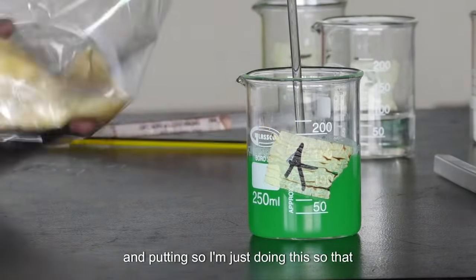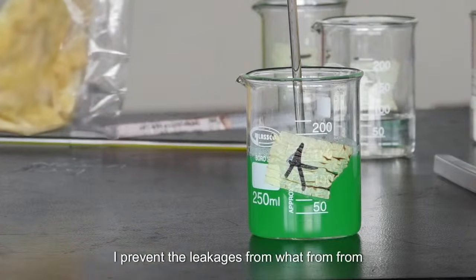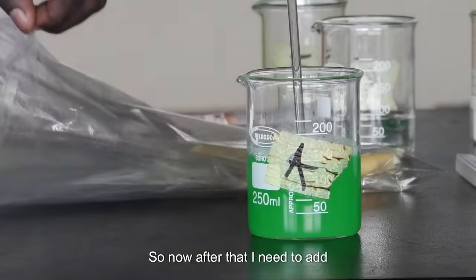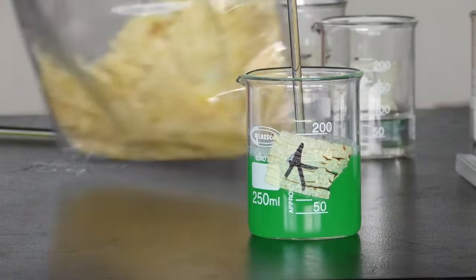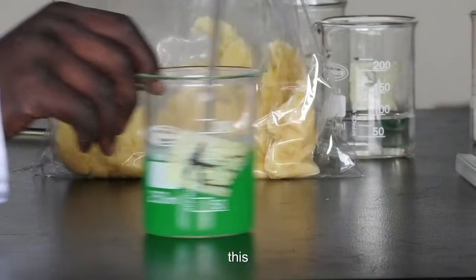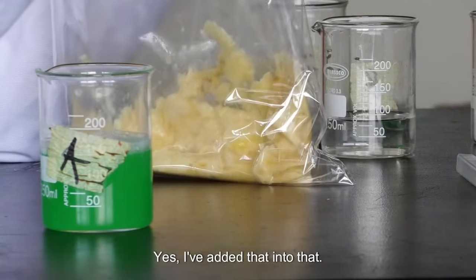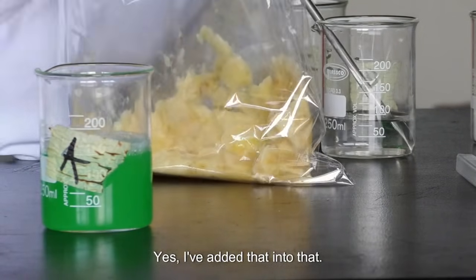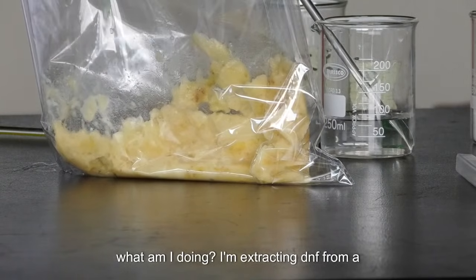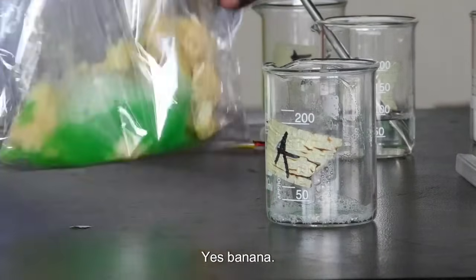You know that. I'm done with putting. I'm doing this so that I prevent leakages from happening. Now after that, I need to add what I've prepared, this mixture, into this. So I pour. What am I doing? I'm extracting DNA from a banana. Yes, I mean banana.